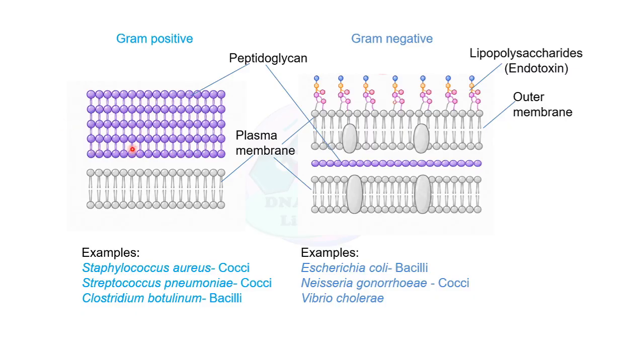So what happens is, since gram positive bacteria have multiple layers of peptidoglycan cell wall, it strongly binds the crystal violet stain. But in gram negative bacteria, the peptidoglycan layer is single layered, so it loosely binds the stain, and when we wash it with ethanol, it loses all the stain. That's why in gram positive we see the color of crystal violet, whereas in gram negative we see the color of safranin.